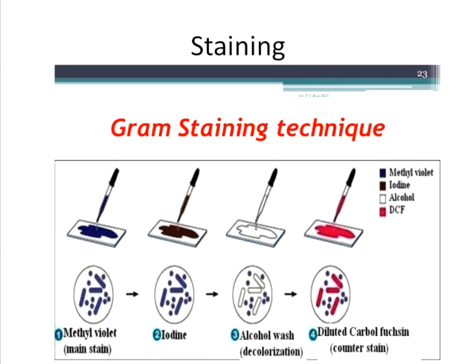The violet color dye is the methyl violet. This stains all the organisms which are put on a slide from a smear as violet in color. There are many types of organisms, so when you use it once, it stains all the organisms as violet.